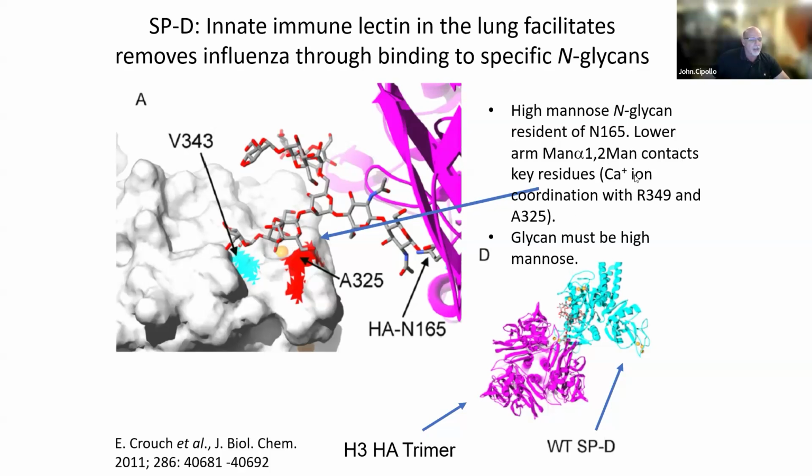I'm just pointing out some calcium ion coordination between some of the residues, and basically just pointing out where this actually binds. This kind of shows you the overall picture.